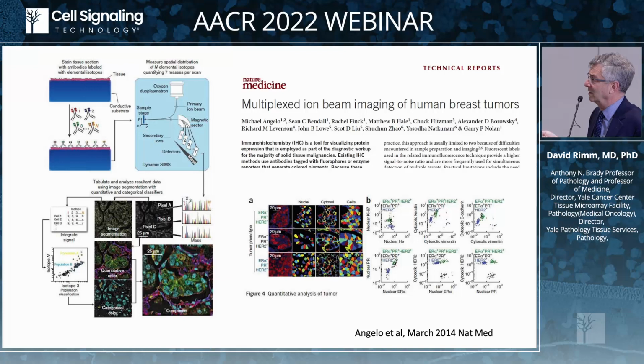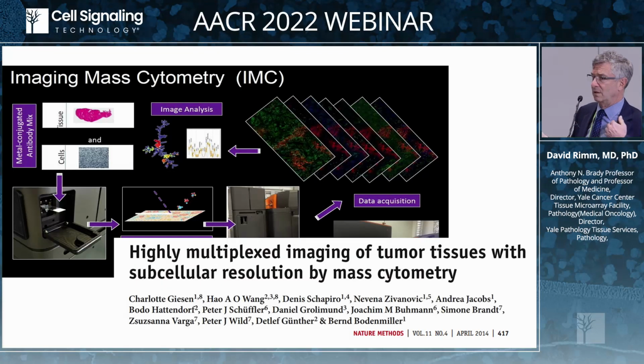But they were able to ultimately make this work and commercialize this technology. It followed on the heels of a technology which preceded it, which is imaging mass cytometry, that used laser ablation instead of ion beam ablation. Lasers are harder to focus, and so the disadvantage compared to MIBI is that it's got lower resolution, but the resolution is still pretty high at 1 micron.